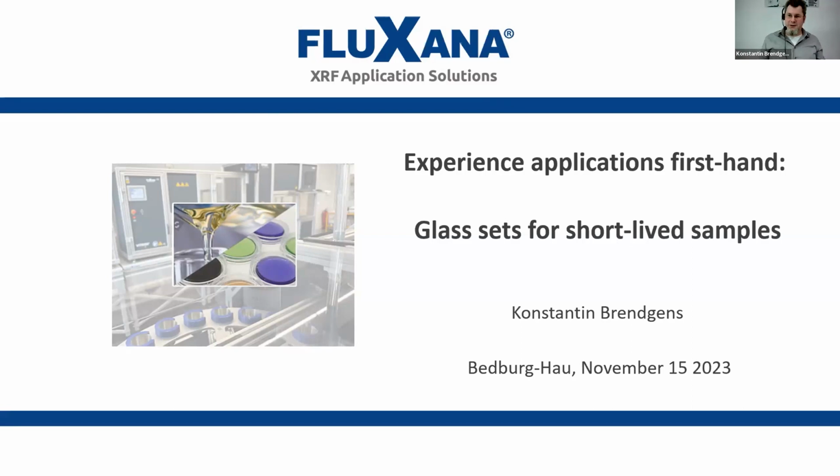And today's topic is one of our first-hand experience of the applications we are running. The topic today is glass sets for short-lived samples, or as we like to call them, transfer sets.